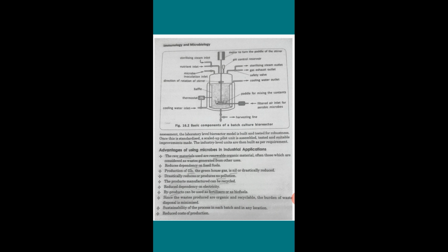In order to produce desirable products at industry level, large culture vessels are used in which microorganisms are cultured at a consistent level or in a consistent manner, and microbial products are produced continuously and these are marketed.